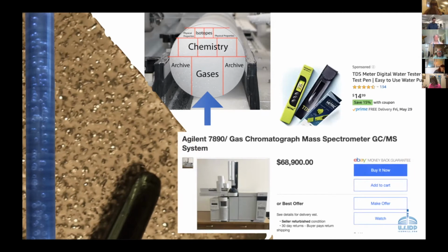So this is a conductivity meter. Let me show you again, every model has strengths and weaknesses. Now, if you can buy a gas chromatograph, mass spectrometer, you can measure carbon dioxide directly. Our $14.99 little gauge cannot measure carbon dioxide directly. However, if you take that little conductivity meter and start by taking the cap off, which is a really important part for students to know. Take the cap off.